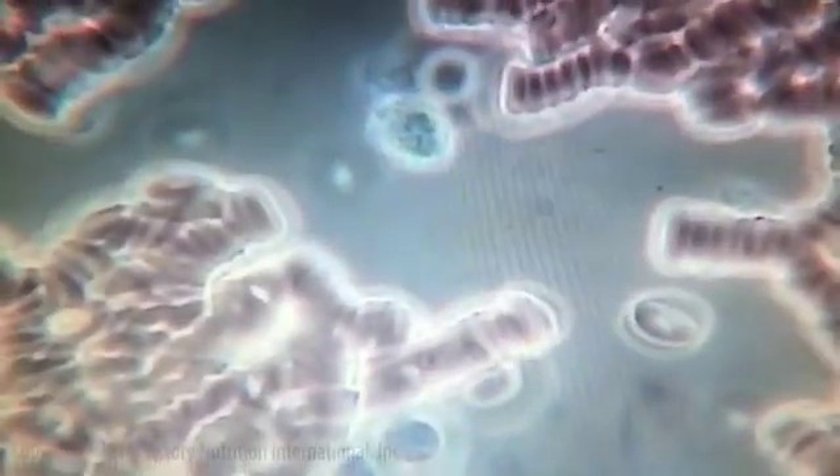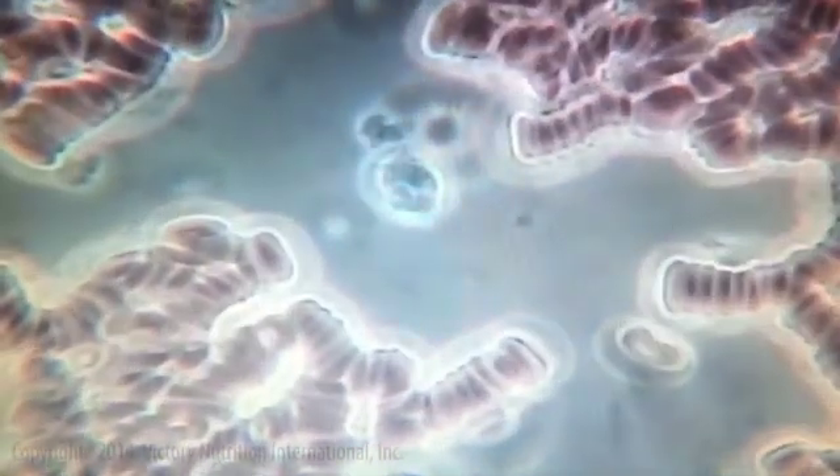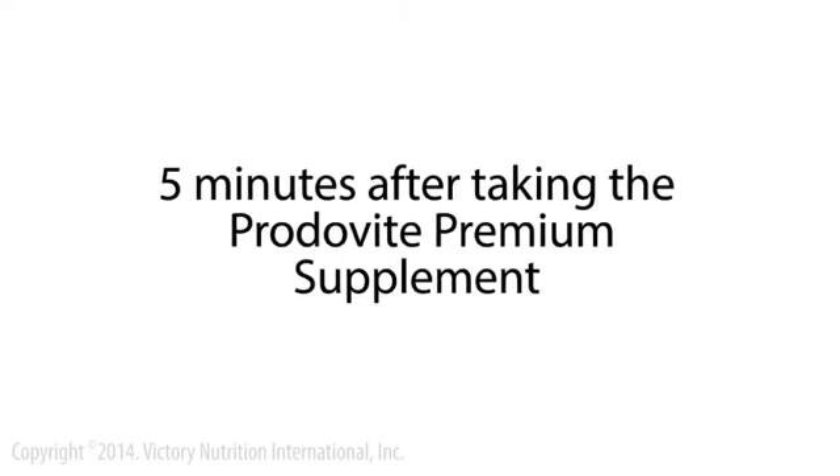The cell aggregation is somehow affecting circulation, and directly or indirectly affecting immune function. There's another neutrophil right there on the screen and it should be two or three times as big. This is five minutes after taking the multi, and we've restored the negative charge.